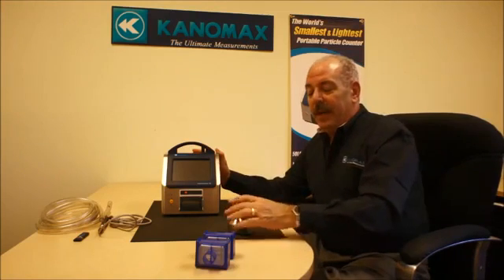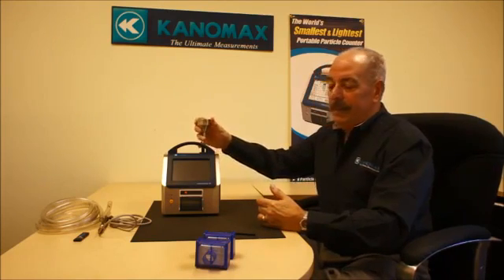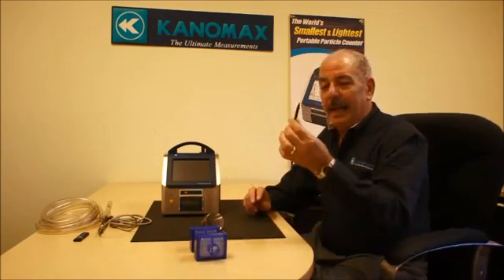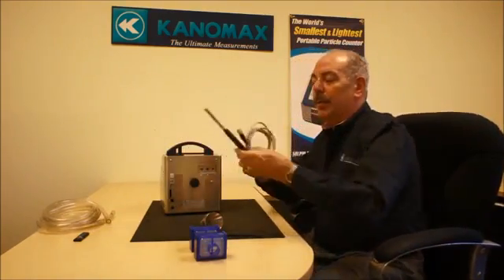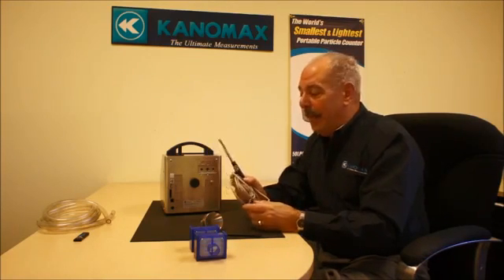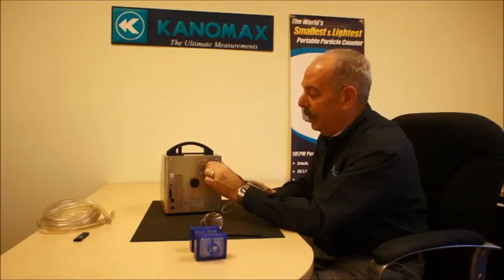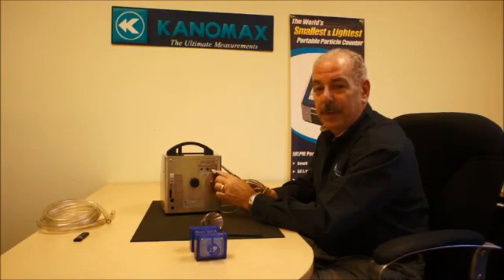The unit comes with an isokinetic probe — you just put it on the inlet — and a zero filter to zero the unit each time for use. It comes with a stylus. Optionally, it has an environmental probe, which is basically our temperature, relative humidity, and velocity probe from our KlimoMaster — a very accurate probe. It also plugs in here and has the availability of an external alarm connection as well as a differential pressure connection.